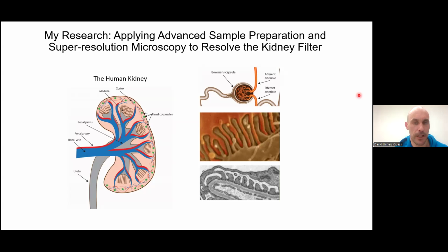In the literature I have found that they use iDisco. Yeah, exactly. So if iDisco works, I guess this ethyl cinnamate could also work, and that's a much easier way to start at least. But I don't really dare to give you that much advice for skin. Yeah, well, thank you.